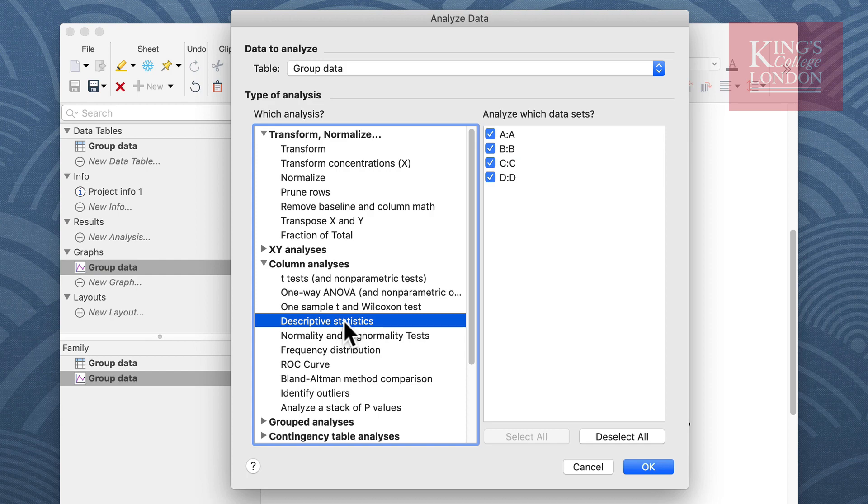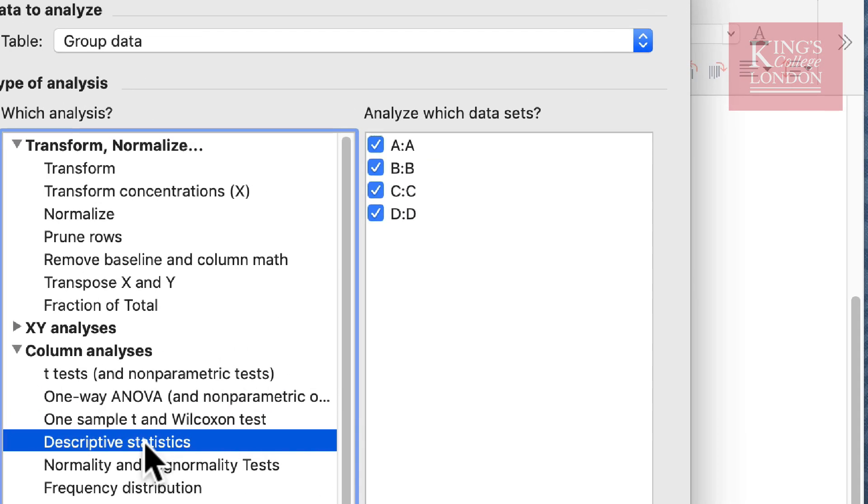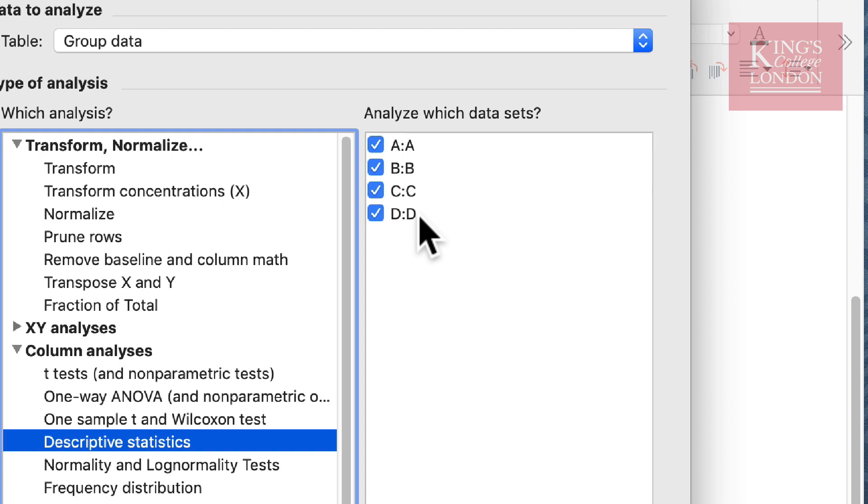I don't have to analyze or show the descriptive statistics from all of my data sets, but in this example I'm going to, so I make sure that in the analyze which data sets option box I've selected A, B, C and D.